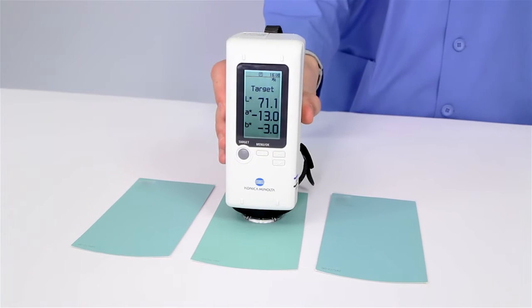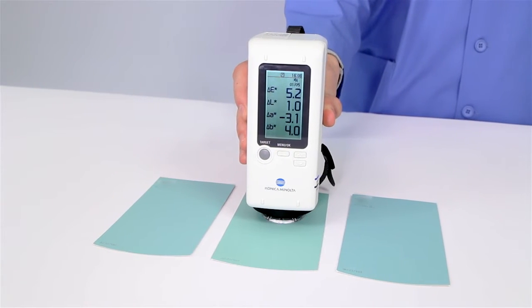With this high-quality, low-cost instrument, you can measure overall color difference between targets and samples in an instant.